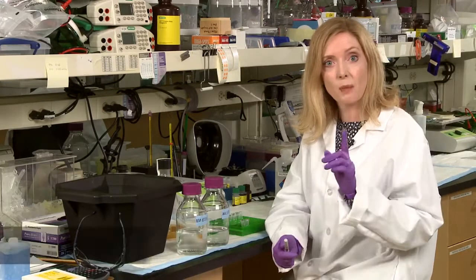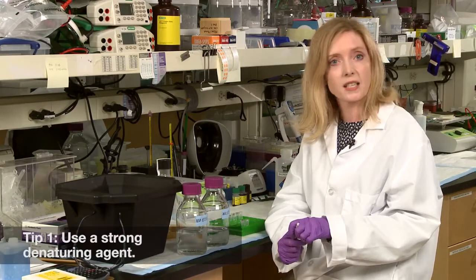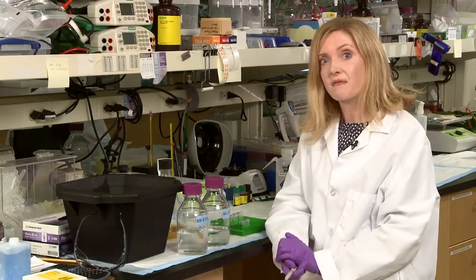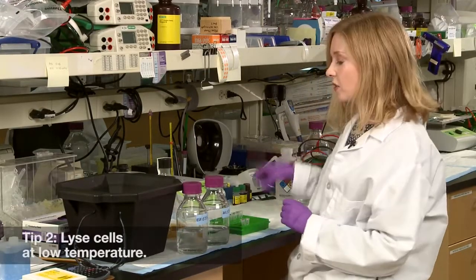Number one: disrupt your samples in a solution with a strong denaturing agent like seven to nine molar urea or two percent SDS, because in this environment enzymatic activity is often negligible.